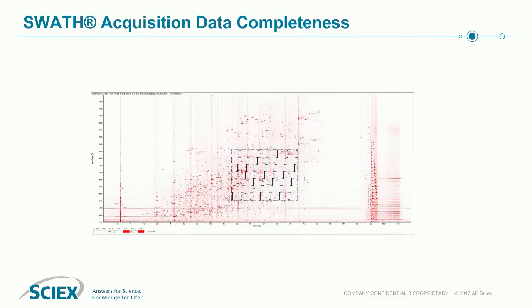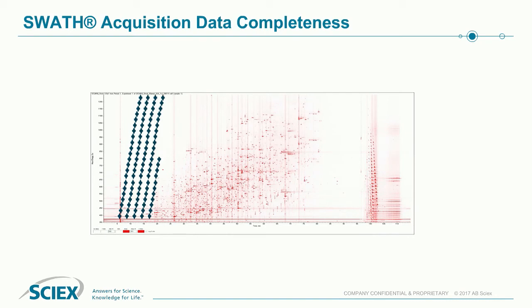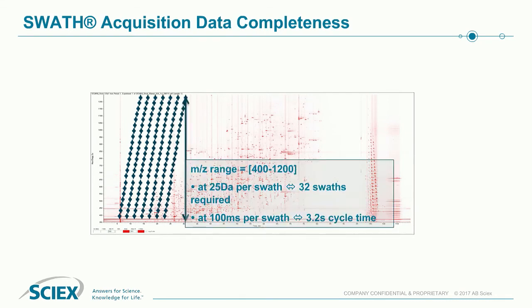What we do know is, as we do this across the mass range, and you can see in this brief animation here, the actual process of the SWATH, we cover the whole mass range, fragmenting all of the precursors which are within those windows, using either fixed windows, which is displayed here at 25 Dalton widths to cover the whole 400 to 1200 mass range, or with variable windows, which allow us to focus much narrower windows to improve selectivity around specific masses of interest or mass ranges of interest.